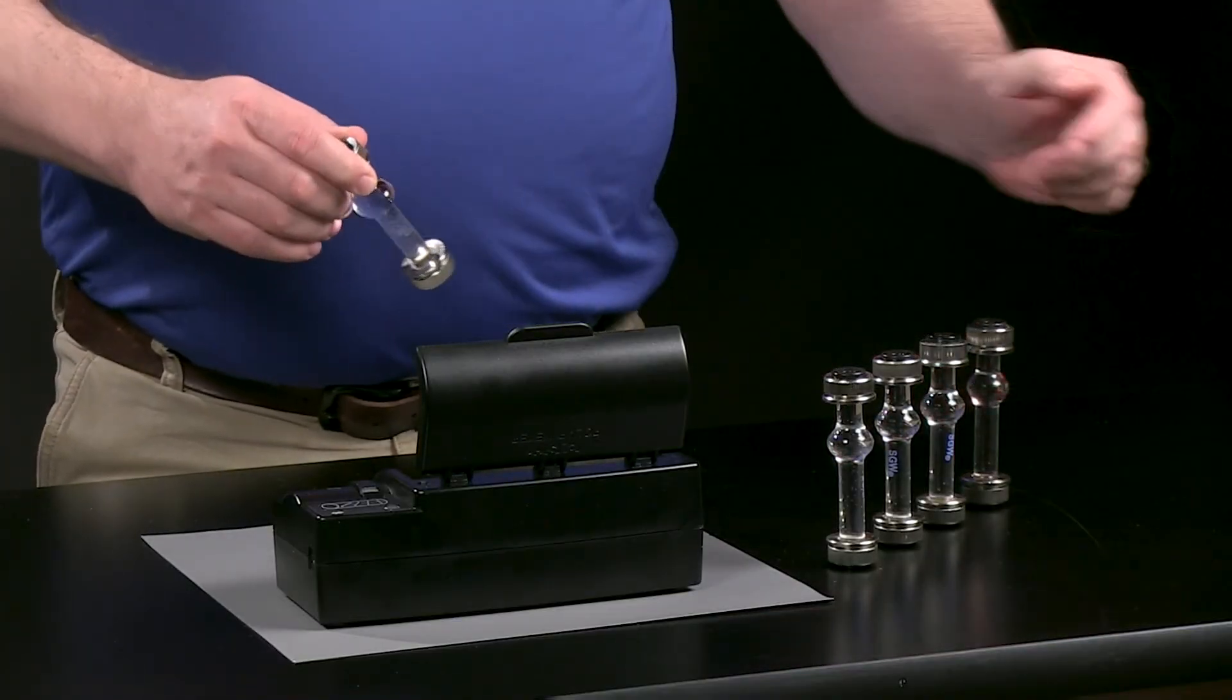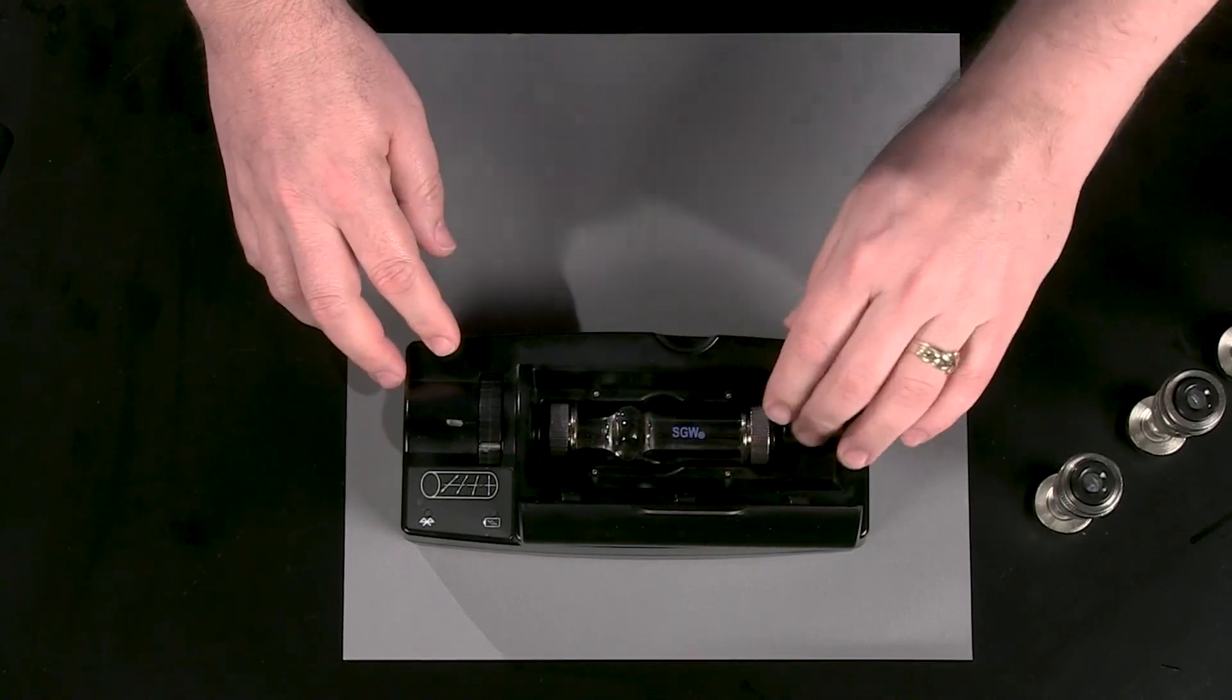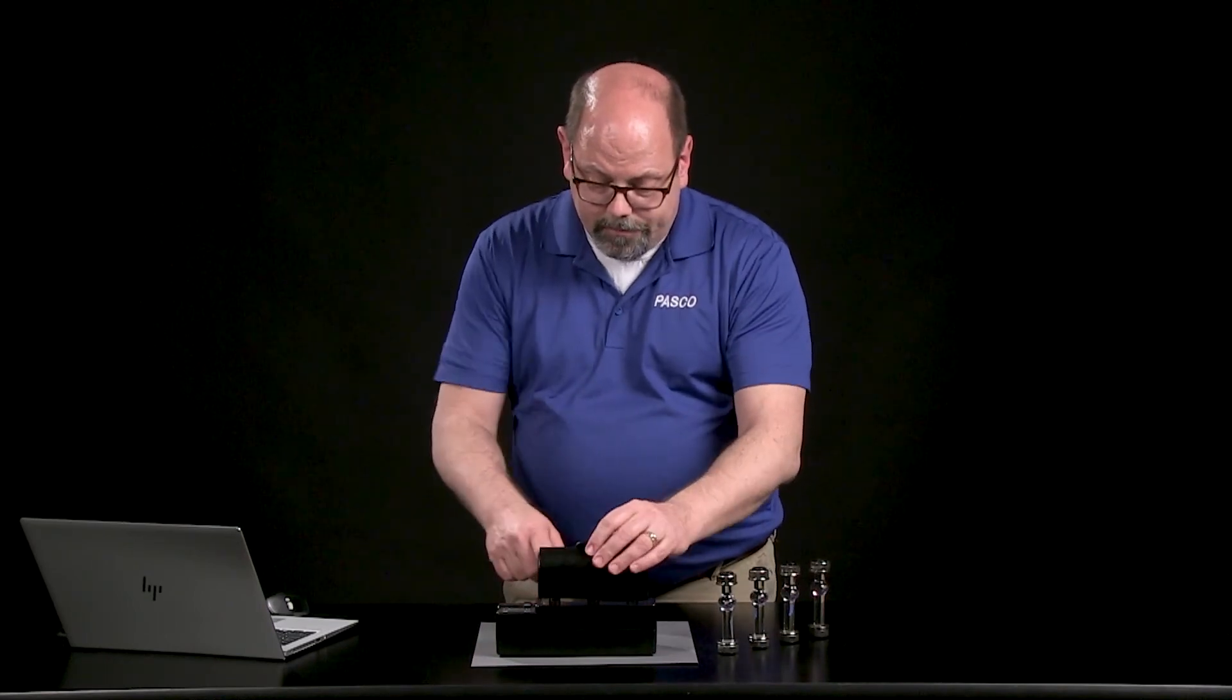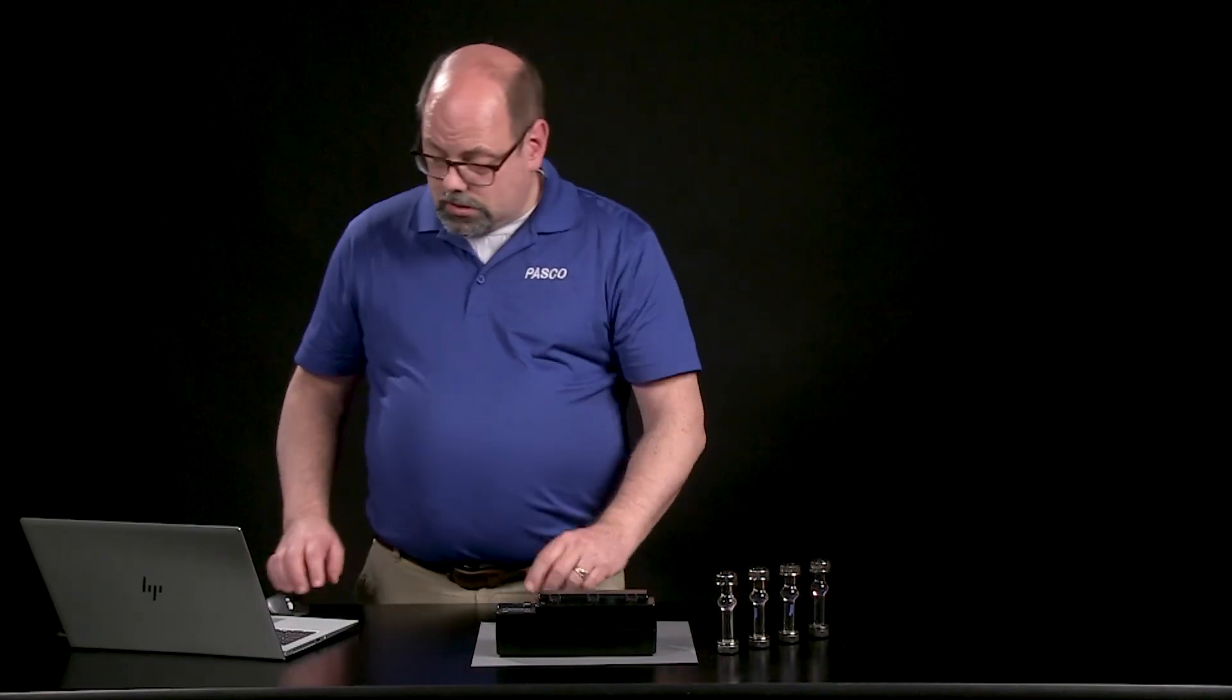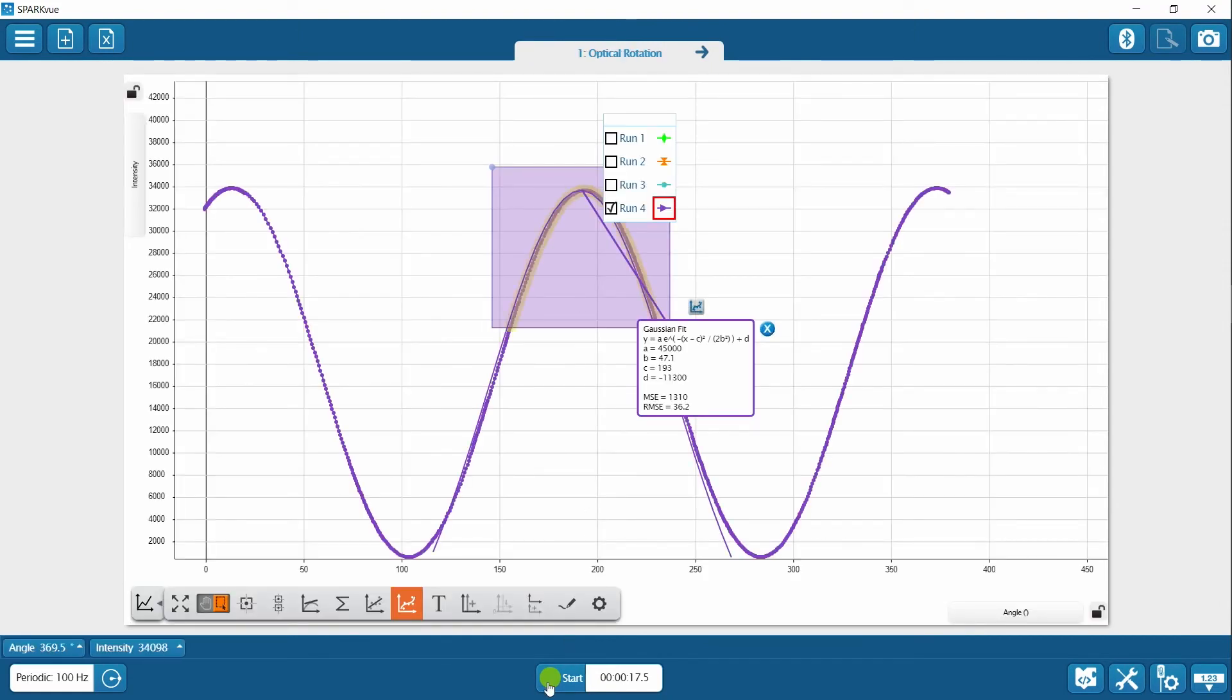There's the last of the standards. I'm going to put in an unknown, which your instructor may have made, so they know the concentration. I'll put the brand up, move this to the right, make sure this is in a good spot. Let's go back to our original curve, and let's run this last one.